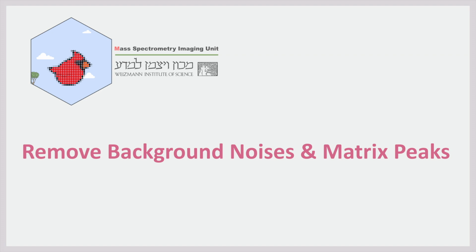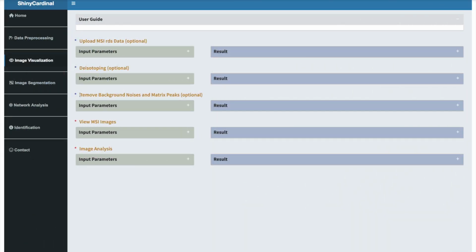This video tutorial is for background noises and matrix peaks removal. This module is located within the image visualization section.